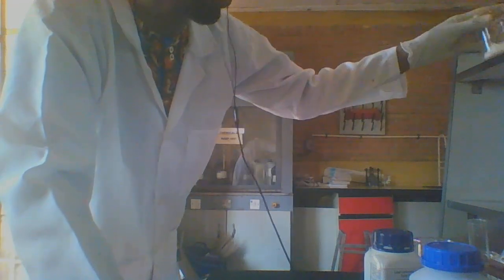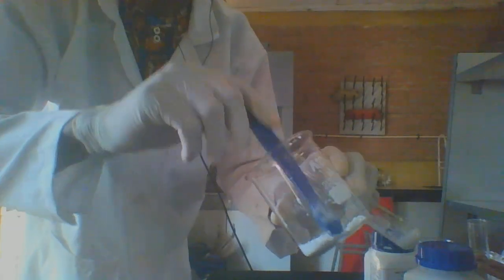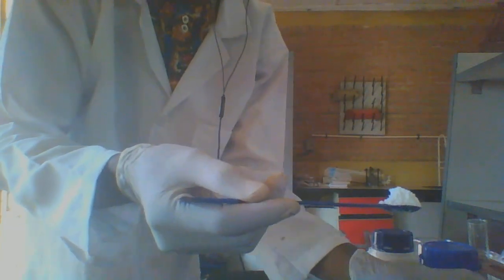Now, the first thing we do is to check the solubility of the sample. It's very obvious that it is insoluble in water. For want of time, I don't want to bother with that aspect. So the next thing, we get a sample of the mixture and put it inside the boiling tube. I'm using two spatula full so as to get enough observation. So this is the mixture.